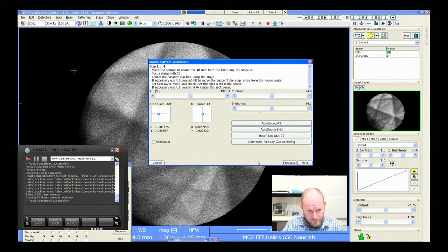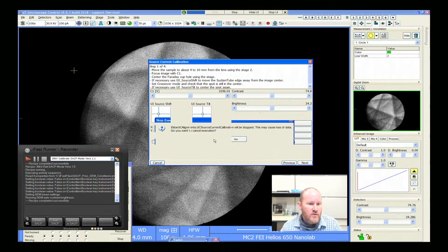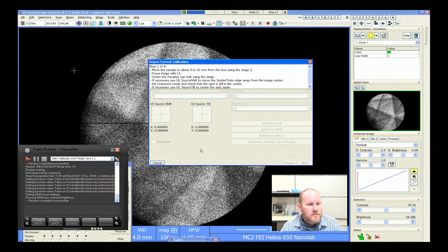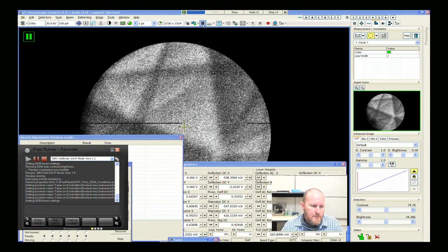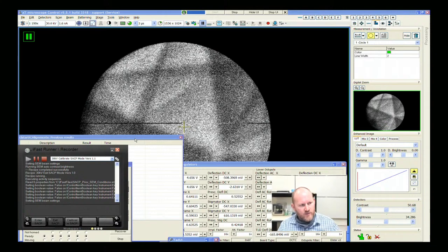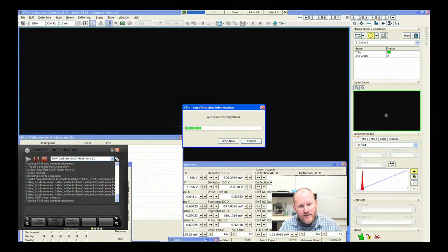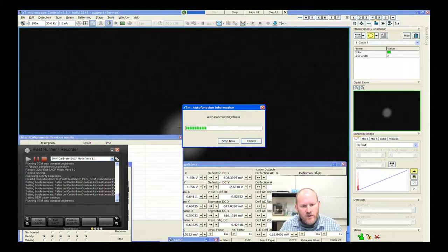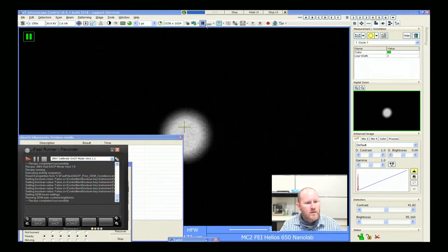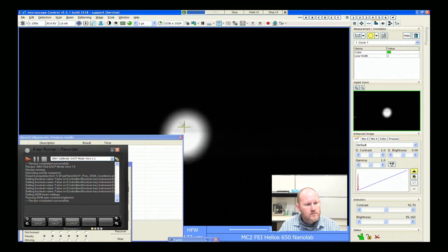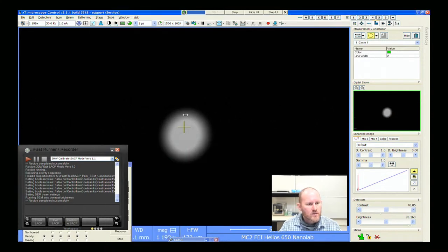Just close this source current calibration — cancel because we don't want to make any changes that will change our electron beam settings. To exit SACP mode, there are ways to get back to normal imaging: you just have to revert everything back to the lookup table by changing the current, and then maybe going in and out of crossover mode to reset your gun values. So effectively what I'm going to do now is just go to a different current value.